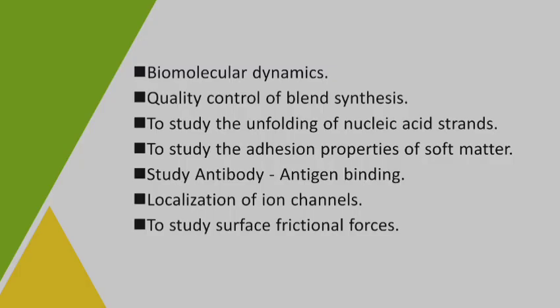The biomolecular dynamics can also be studied. The quality control of blend synthesis compounds can be studied, the unfolding of nucleic acid strands can be studied, and it is also used to study the adhesion properties of soft matter, antibody antigen binding and localization of ion channels, and the surface frictional forces. Atomic force microscopy can be used for all of this.